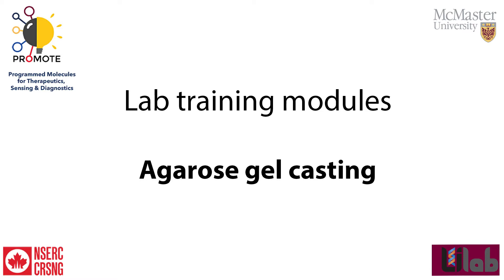Hi, my name is Connor. I'm from the Leelab and today we will make an agarose gel.